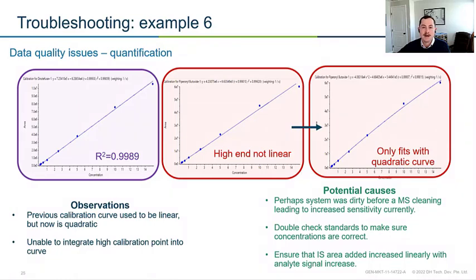If that's the case, there's no big issue. We can just adjust the method to sort of account for this. And the easiest way to account for this, regardless of the cause, would be to go ahead and either inject less. That way you don't have to change any of your sample preparation procedures or your SOP, anything like that. And the other option would be just to use a slightly less concentrated solution. So you can decrease your upper LOQ. So it'll depend a little bit based on kind of your goals and what you're trying to accomplish, which way you choose. But you have a couple options there to sort of eliminate this issue.